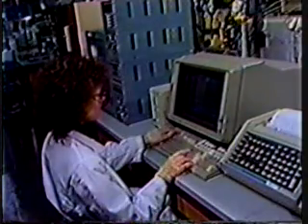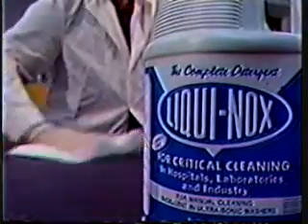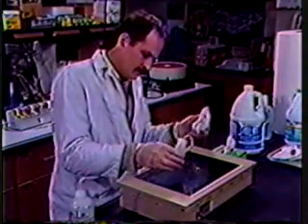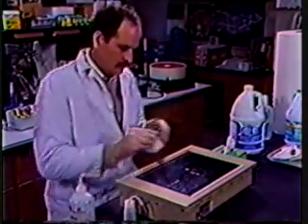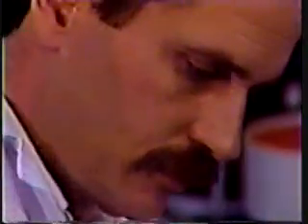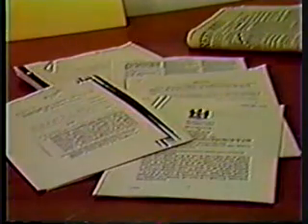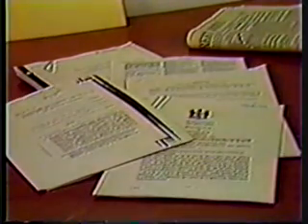Now, some of you may be thinking, I don't work around hazardous substances. Well, think about a bottle of disinfectant, cleanser, or reagent. The disinfectants you use on your equipment, or any number of chemicals with which you frequently come into contact, might be hazardous according to laws in effect today. Recently, OSHA instituted the laboratory standard in order to address employees' exposure to hazardous chemicals in laboratories.